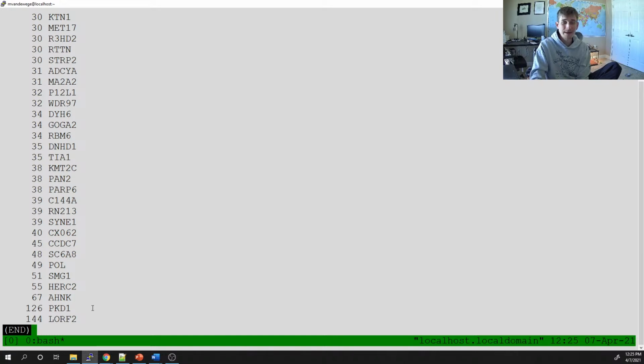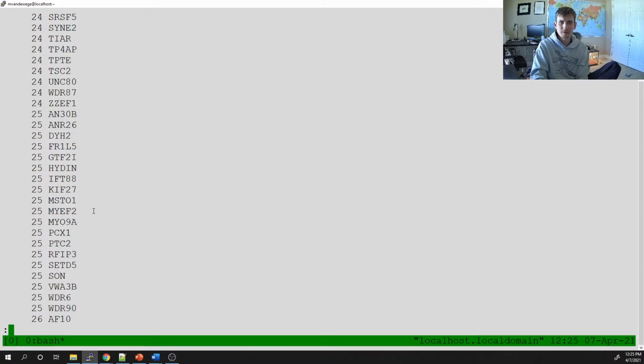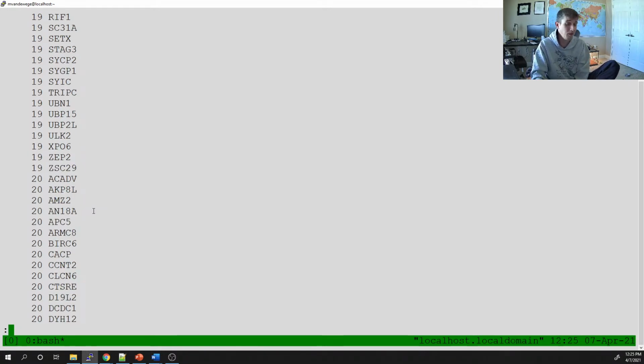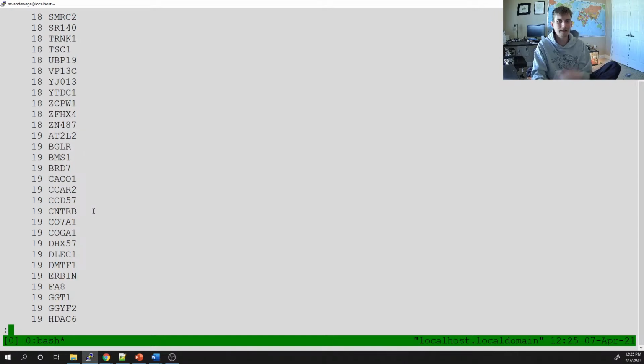Now the thing is, we see a lot of these genes annotated more than once. But if we scroll up, they reduce quickly. And I want to say I expect, and you should almost expect, somewhere between 5 and 10 alternatively spliced transcripts in a transcriptome for every gene. That's kind of how biology is, given how crazy alternatively spliced transcripts get. Furthermore, again, just imperfection of assemblers. Genes can be fragmented when they're assembled. And so we may have a 5' region, we have a 3' region, but we're missing the internal stuff. So we're going to leave it all there.